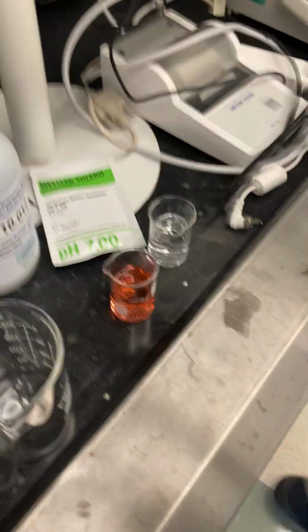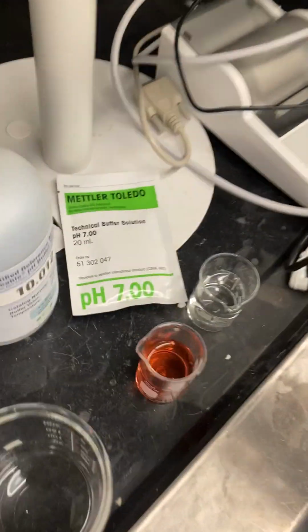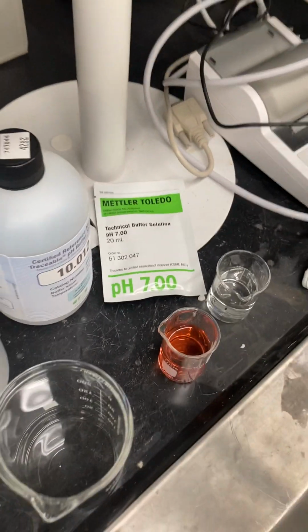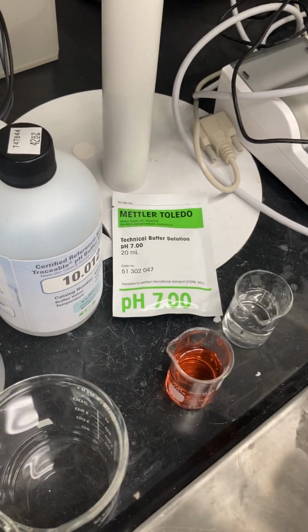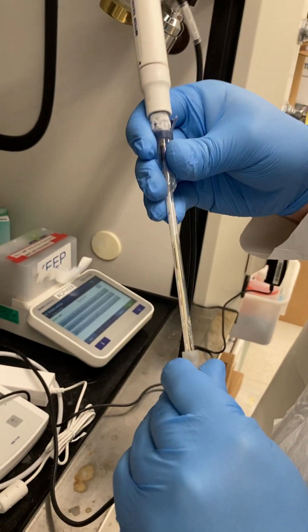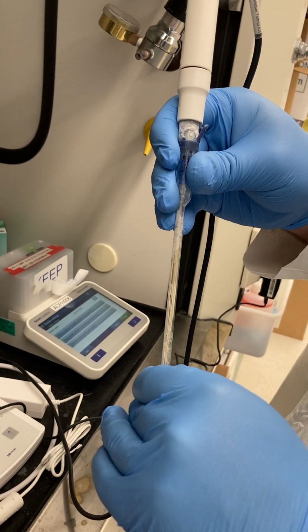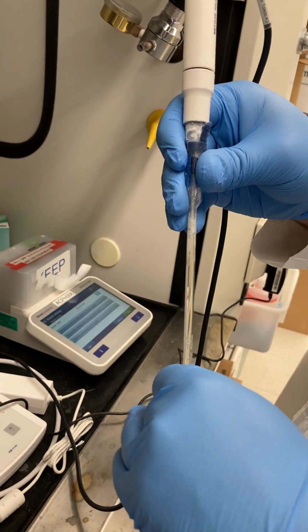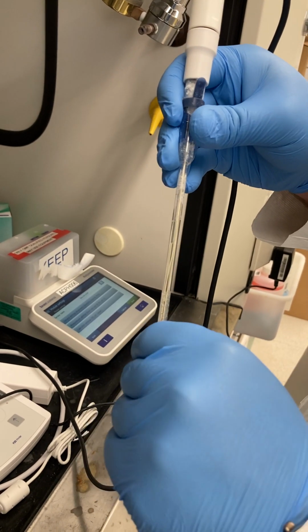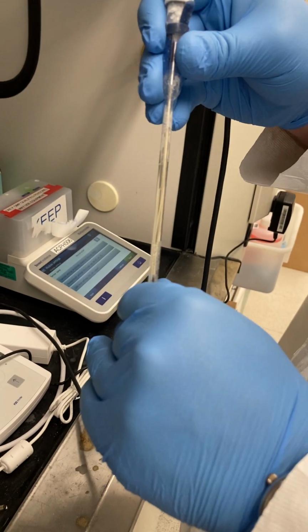So when we do the actual documentation part of this, we'll use that. But for now, for the standard individual, we'll just do 10. So try to be careful because these are made of glass, but this one is old and crusty. Yeah. So it is not really wanting to come off.